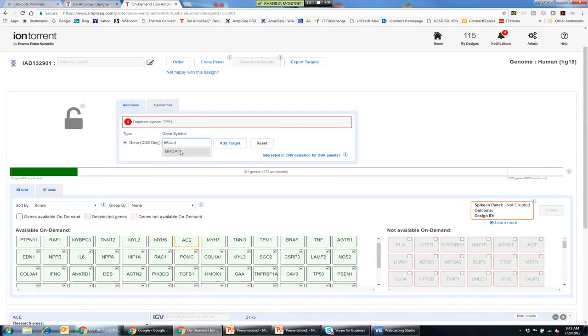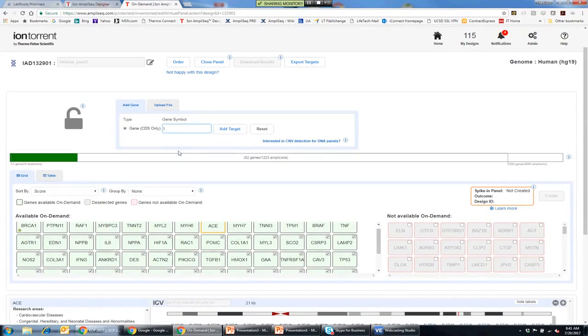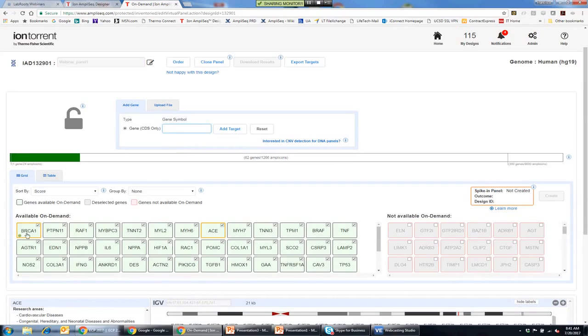So then life is okay. Let's say you want to include a different one. Let's say I include the infamous BRCA1 gene. What it will do is add it to my list, and it will label it here with a little dot to say, hey, I added this after my initial selection. So it's easy for somebody to say, okay, this is my first selection that I've created, and then I have my additional content that I created.